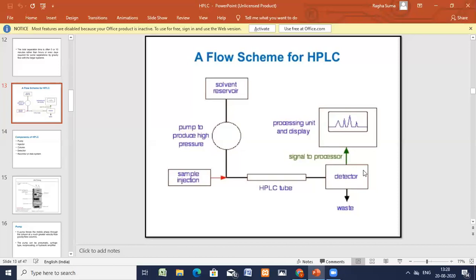Now the materials used for the column stationary phases are porous beads and pellicular beads. These are the different types. You can separate vitamins, benzoic acids, drugs, amines, oligosaccharides, fat soluble vitamins, fatty acids, steroids, drugs, etc. The mobile phases which we are using are chloroform with hexane, only hexane, hexane with isopropanol, acetone, and chloroform with isopropanol. So we can use different types of mobile phases.